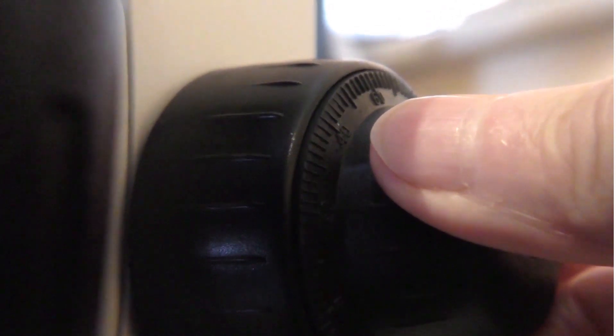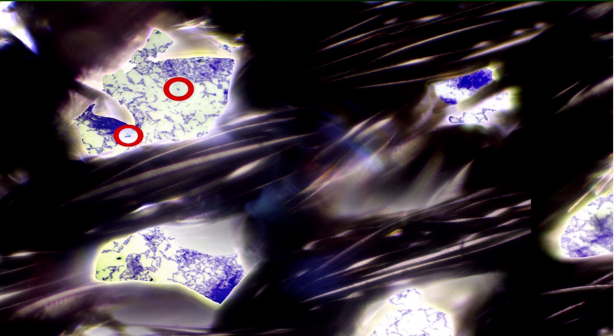If I adjust the image I can add red circles to show you. On the right is a single bacterium. On the lower left is a bacterium dividing in half. They are small.